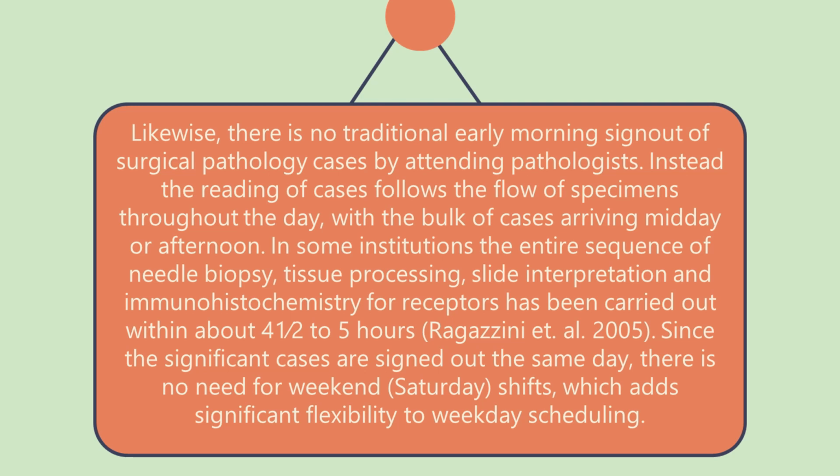Since the significant cases are signed out the same day, there is also no need for weekend or Saturday shifts, which adds significant flexibility to weekday scheduling. Another advantage of rapid tissue processing is that you can do your work as the tissue processing goes along. And then there's no need for weekend duties, no need for overtime, and no early sign-ins and late sign-outs.